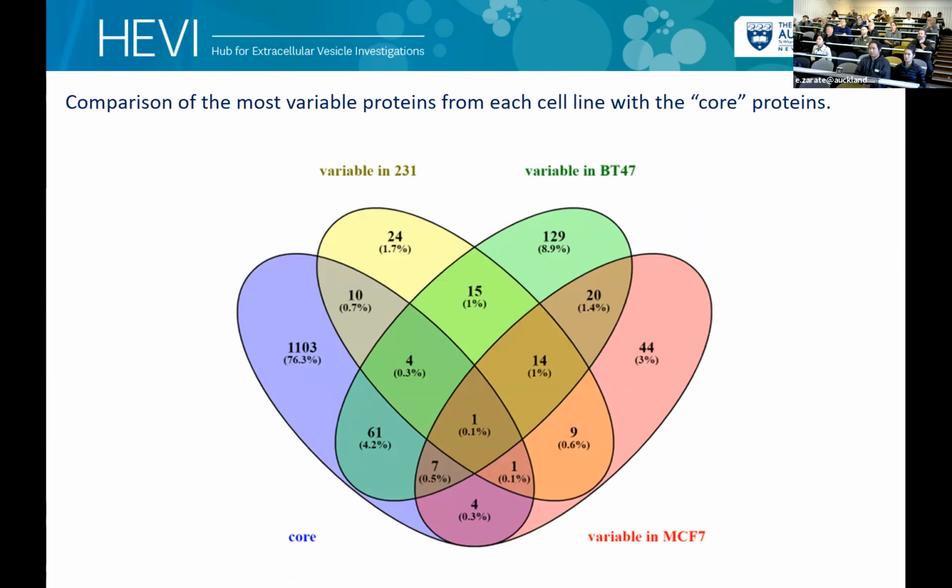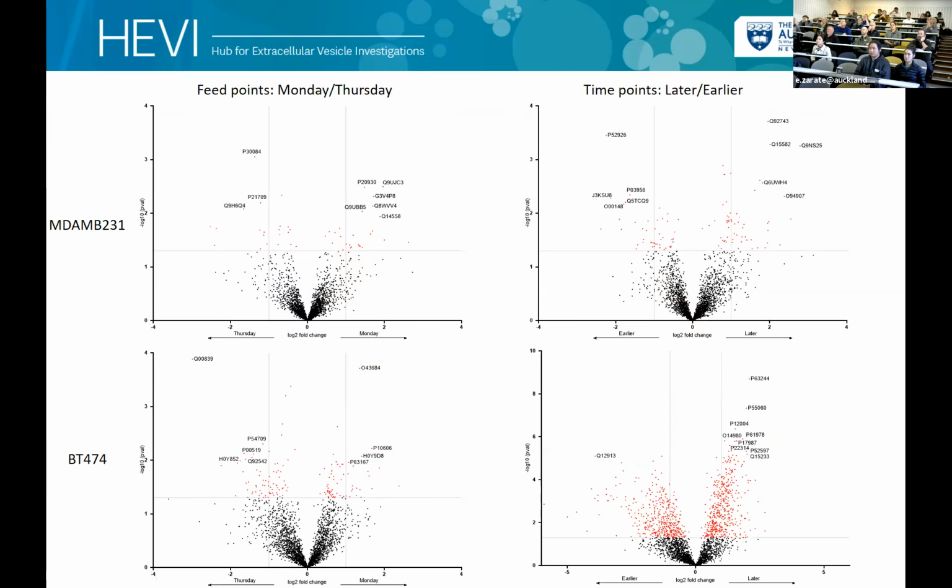So we started wondering about the source of variability and changes in these groups. And it turned out that our initial idea, that the feeding cycle affects them, was actually not right. What was affecting these proteins was the beginning or end of life of the bioreactor. And we are looking in detail at these proteins at the moment to identify if there is a biological reason or if these proteins are just less stable than the rest.